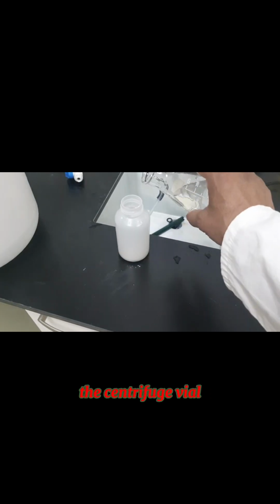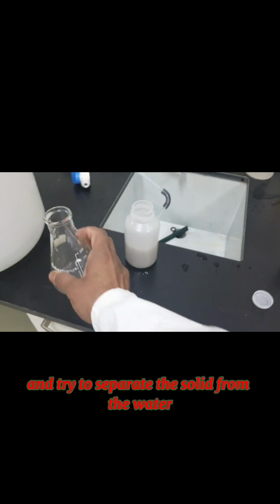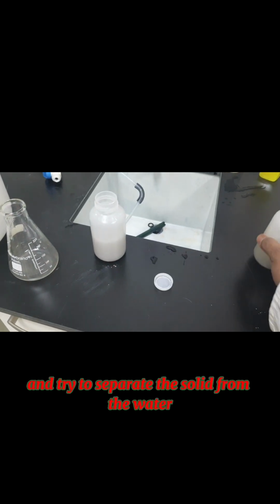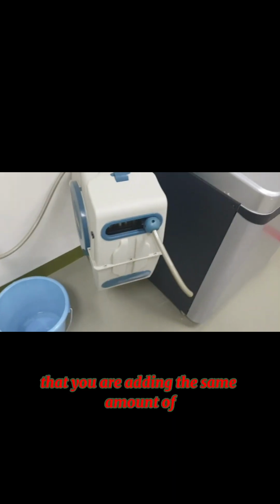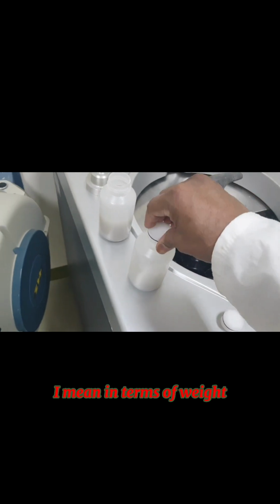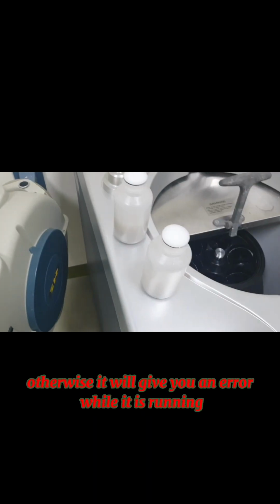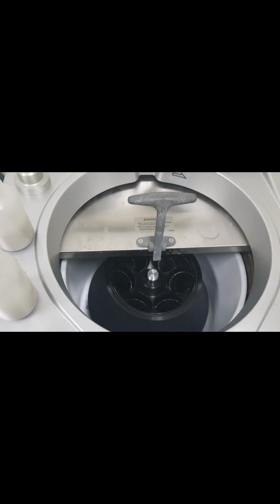Now into the centrifuge vial, I will add 100 ml of water and try to separate the solid from the water. You have to make sure that you are adding the same amount, in terms of weight, otherwise it will give you an error while it is running.